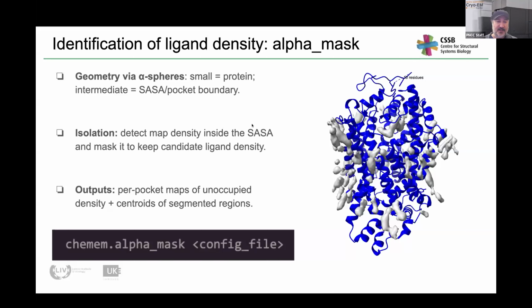So you've spoken about fitting into EM maps. Do these methods work for crystallographic maps? No, not currently. I guess crystallography have their own software which works great. Yeah, TEMPy-ReFF's not designed to work with crystallographic data.